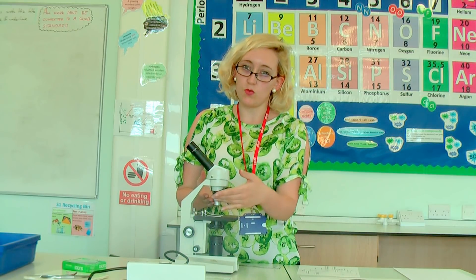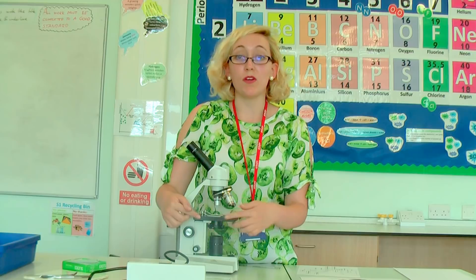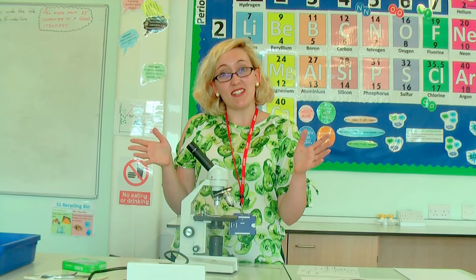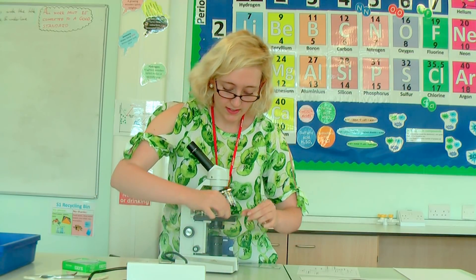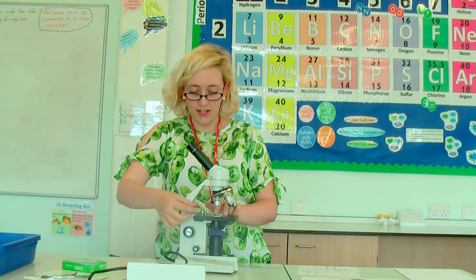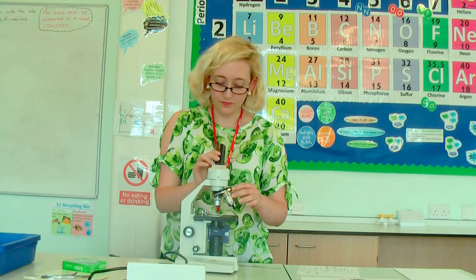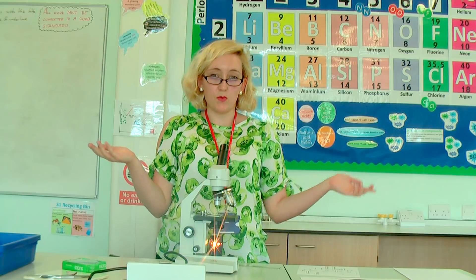We also have what we call the stage, which is where we put our slide. We call it a stage because it's where the amazing stuff goes — that is where your slide gets clipped on with the clips. I'll grab my onion skin slide. It's important to clip it in place because when you are adjusting, you don't want to accidentally move your slide and lose the cells you are focusing on. So we clip that in place.